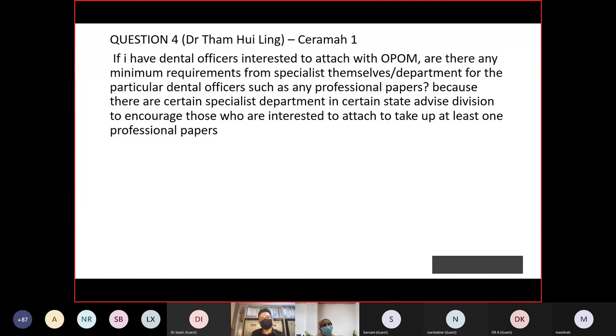So Dr. Shalid, in that case, better to hold the biopsy first, right? Yes. If non-urgent, it's best to hold the biopsy. In Sabah, usually we hold for 3 days only before we process. That's a different lab, different SOP, right? Yes. But it's very similar, along the same line, I would say.